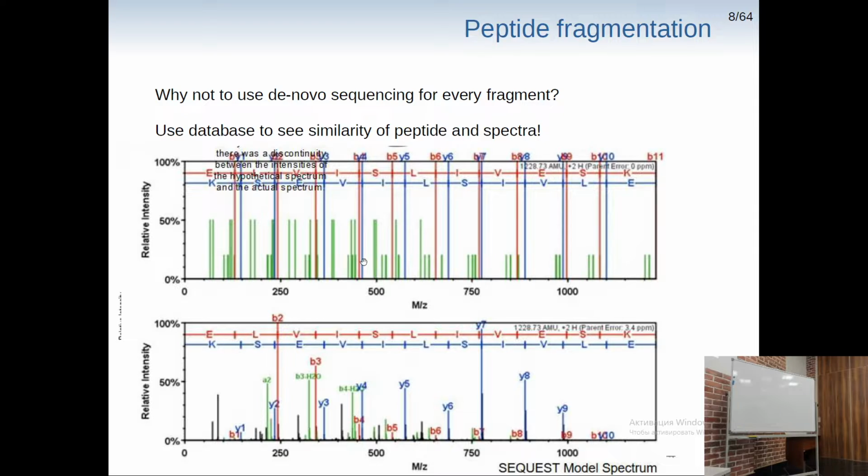There is no need to pre-generate them. And you can just compare the one that was made in silico and the one that you actually have. This way, the annotation is quite easy. If you have something similar, you can annotate your peaks and see which peaks are true and which peaks are either noise or anything else.